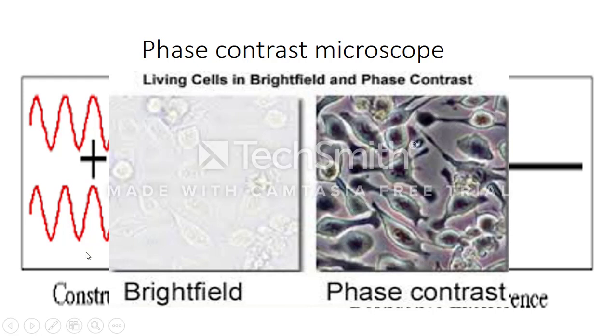And in the other case, if we use constructive wavelengths and they come together, they would create a brighter image such as this. And it is very difficult to see resolution in this case. The resolution is not optimized.